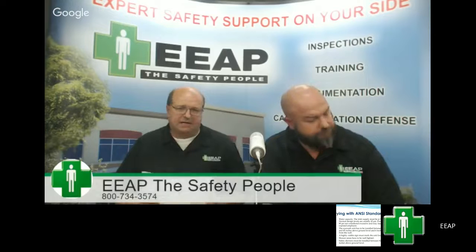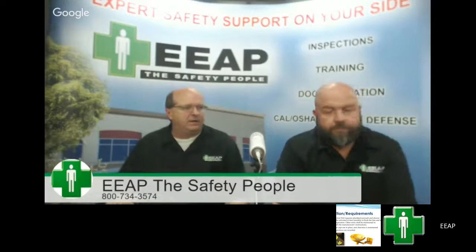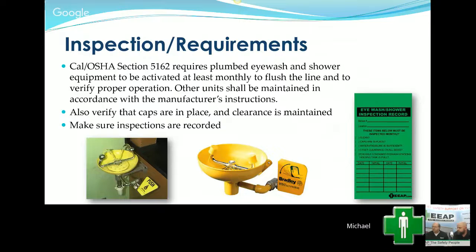Exactly, and yeah, that cleanliness, like you say, I mean, people that don't use them very regularly, things just tend to build up in there unless you're maintaining it. So let's go on here and talk about the inspection requirements, and these really are the issues that Michael just talked about, that they're really hitting you on for citations.